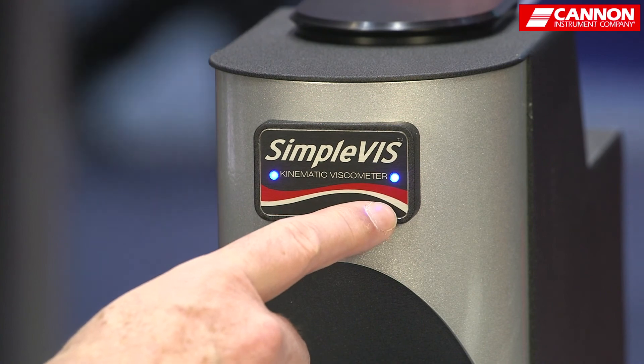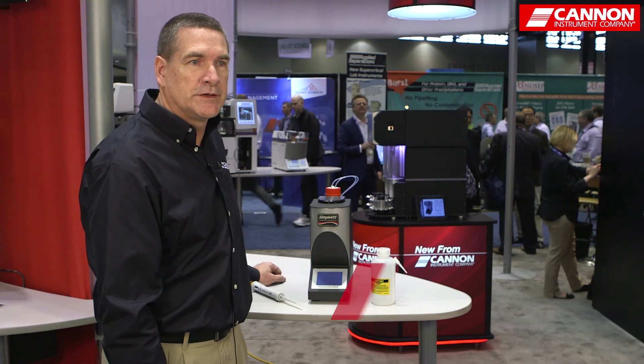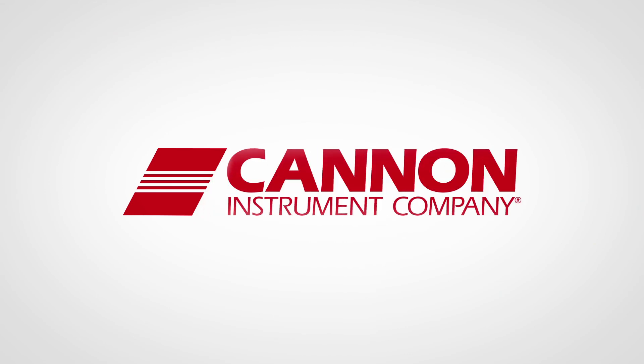We have lights on the front that tell us when it's ready to run. For more information, you can visit us at CanonInstrument.com. We have videos and information available for you. Thank you.